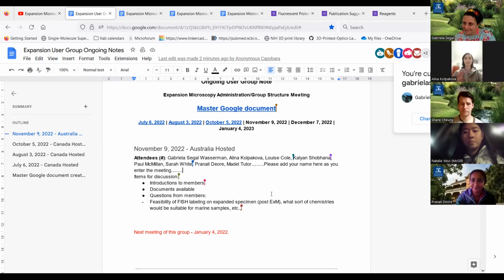Hey, can I go next? Hi, my name is Alina, and I'm not from Australia. I just got a link from my colleague. I'm from Israel, so it's 5 a.m. here. Oh, wow. But I was really keen to join this meeting because I'm really excited. I've been using expansion microscopy for a couple of years already. I work on Drosophila, and I had success in expanding using different protocols and doing 16-fold expansion also. And using different dyes and stuff.